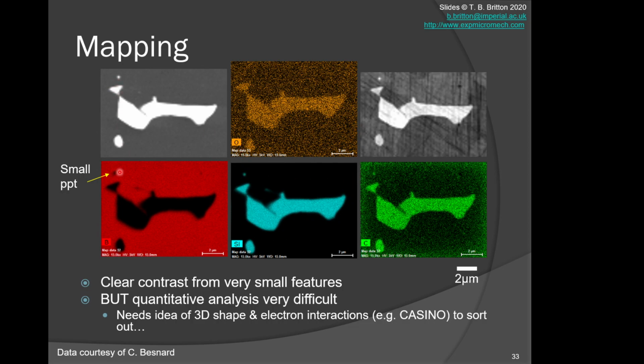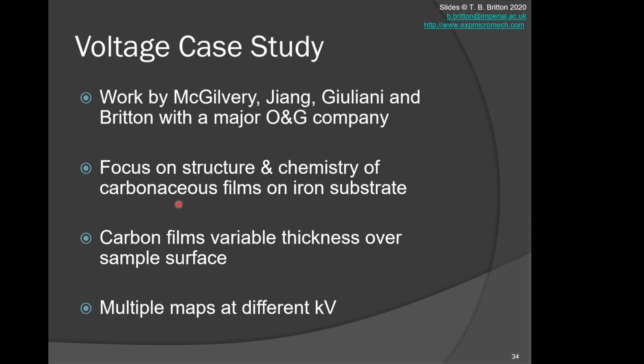We can see in this example, this precipitate is probably not oxygen rich, although it's slightly harder to see because the resolution of the oxygen is not as good. We can see the morphology coming out, that silicon, that edge of morphology is present. We note, though, that I could not likely give you a quantitative chemical analysis for this particular point because there'll be contributions from the matrix. It's fuzzy compared to some of the more definitive regions inside this large precipitate. So care with that quantitative versus qualitative analysis comparisons.